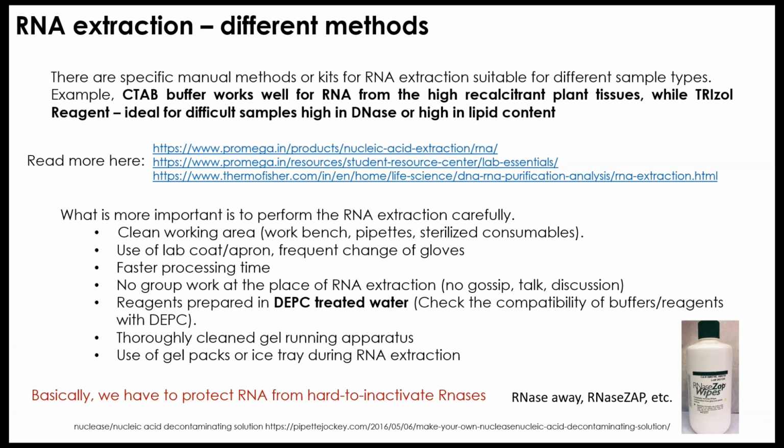And you can use gel packs or the ice trays or the crushed ice to keep the reagents or keep the RNA in between the procedure, right? So basically, we have to protect the RNA from hard to inactivate RNases. There are several commercial products like RNaseAway or RNaseZap, which is widely used across the world in the laboratory as a decontaminating solution.